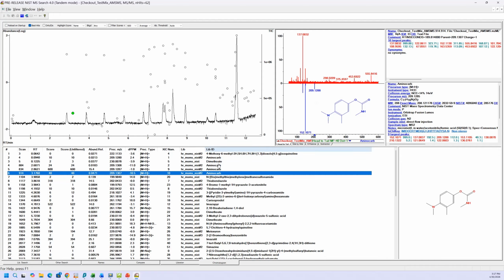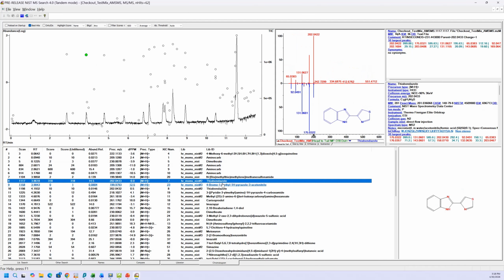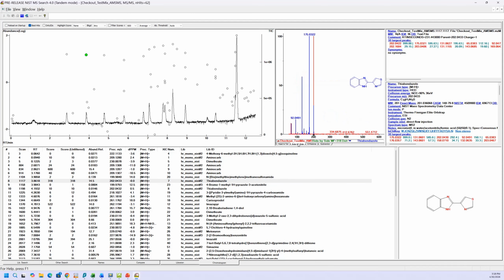I like the butterfly plot if I was comparing things. This would be the hit for that particular peak. Let's just pick one here, this green dot. And this is what it thinks it is. Whatever the unknown, the MS2 in this case, it'll be an MS2 spectrum for the, of course, for EI-GCMS, it would just be the EI spectrum. And on the bottom, you have the best hit. And so you can, like I said, stretch that. And you can also change the side by side and difference, etc. But I like head to tail. I call a butterfly plot the best.